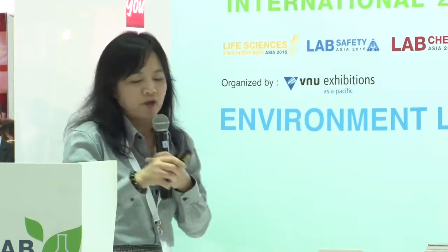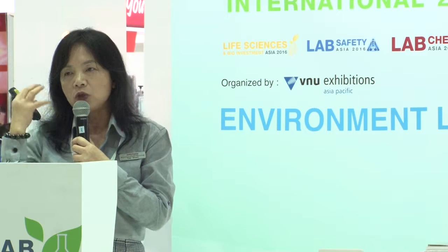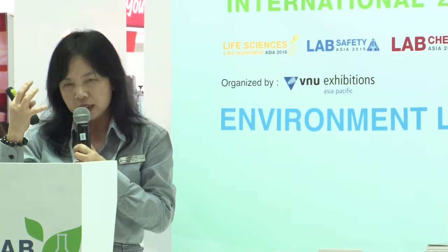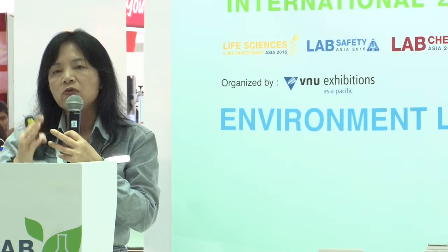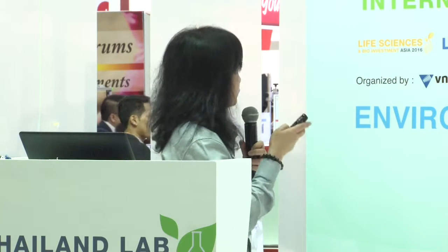So that's called fingerprinting. I can also do isotope dilution. That is, you add an enriched internal standard, and then you accurately measure your isotope. Isotope dilution is used, for example, by national institutes like NIST, who need to produce a CRM and measure very accurately, so they need to do that process.